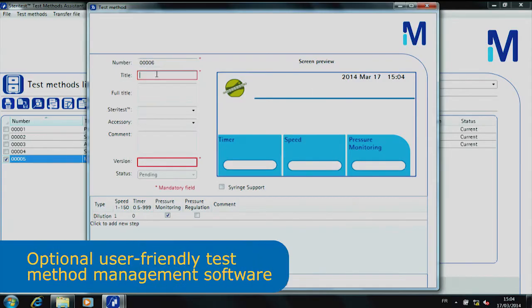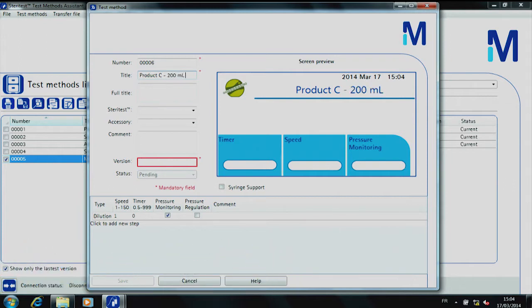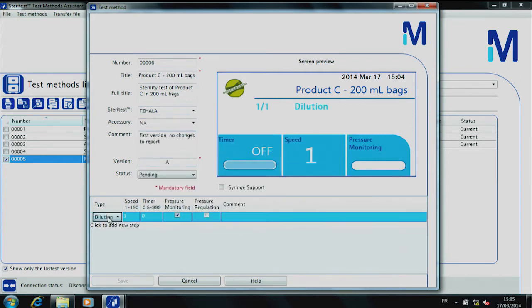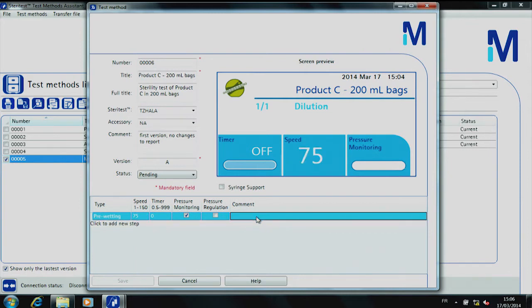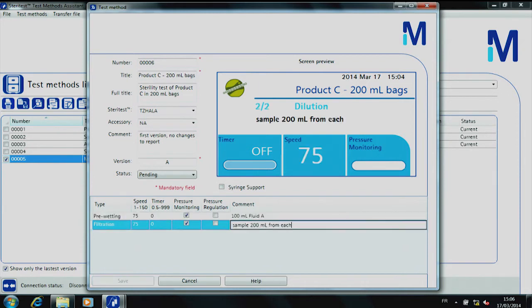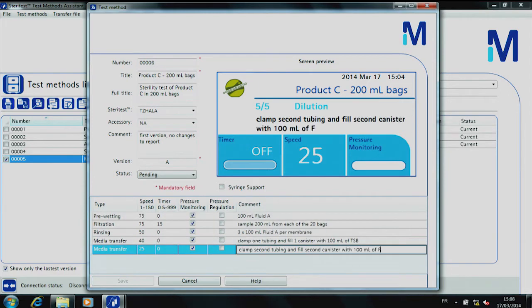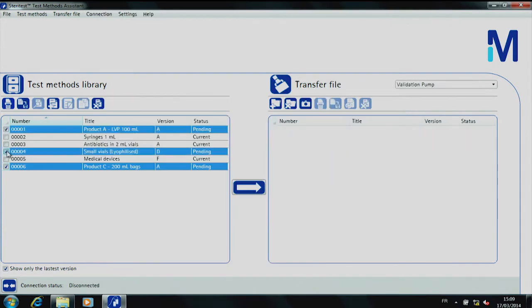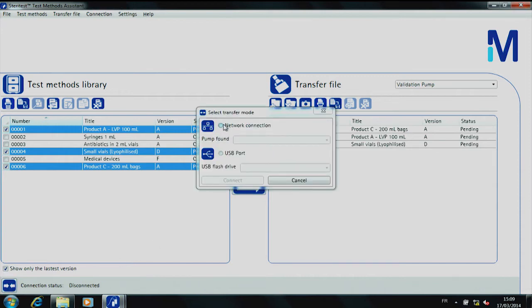The user-friendly SteriTest Symbio PC software offers the opportunity to ensure test reproducibility. You can easily create a test methods library and transfer the selected test method to your pump.